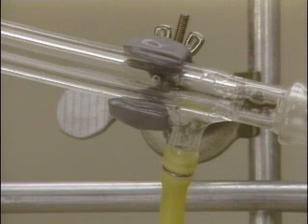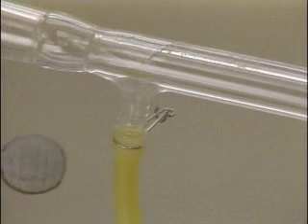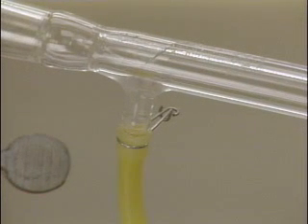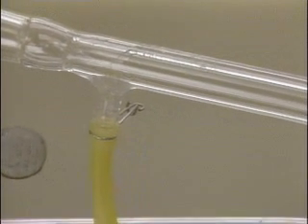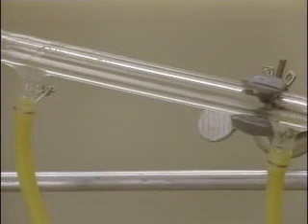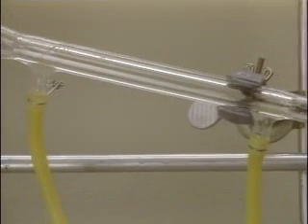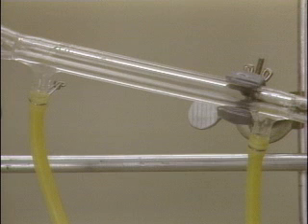Flexible tubing is connected from the lower end of the condenser to a water source, and a second length of tubing is connected from the upper end of the condenser to a drain. The water must flow into the lower end of the jacket of the condenser to ensure proper cooling of the distillate vapors. The water should flow through the condenser continuously, but slowly. If the water flows too fast, it puts too much pressure on the tubing and connections, and they may come apart during the distillation.